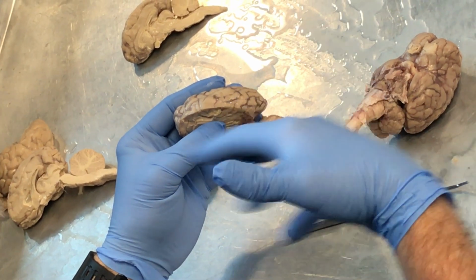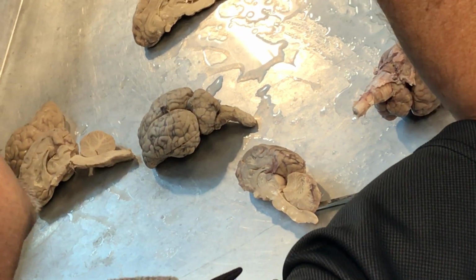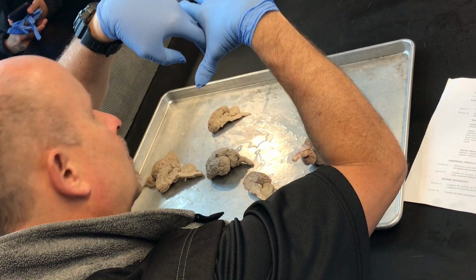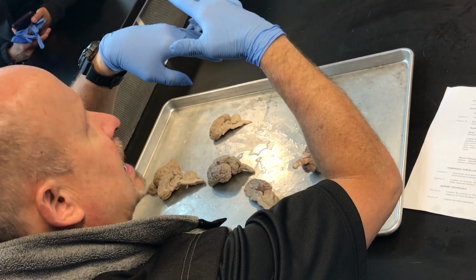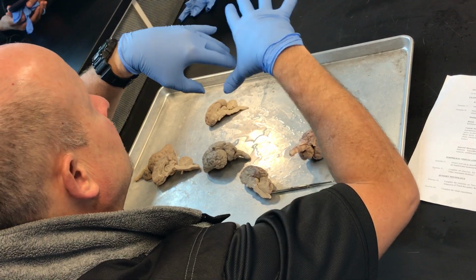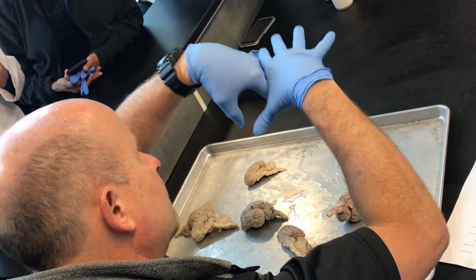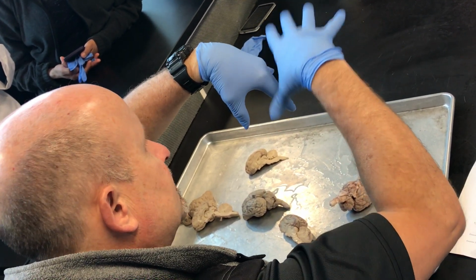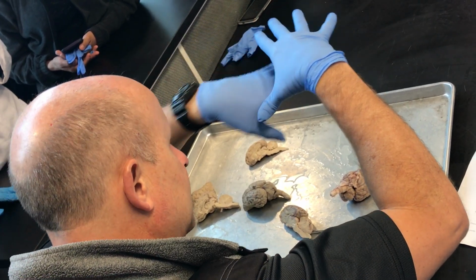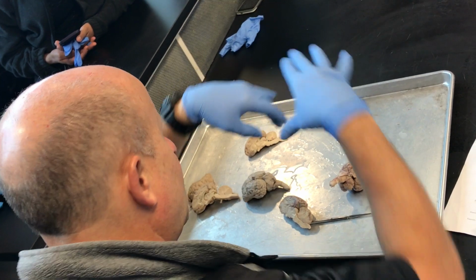And then the arachnoid layer, or the arachnoid name that we give, are actually the little tendrils. So the dura is up here, the arachnoid layer is here, and these little tendrils stick down and look a lot like a spider web. We'll show you that in lecture on Tuesday. It sticks down like this and attaches, kind of like guide wires, to the deeper layer so it doesn't tent up too much. So this is the arachnoid layer, and where the CSF, cerebrospinal fluid, is down here is called the subarachnoid space.